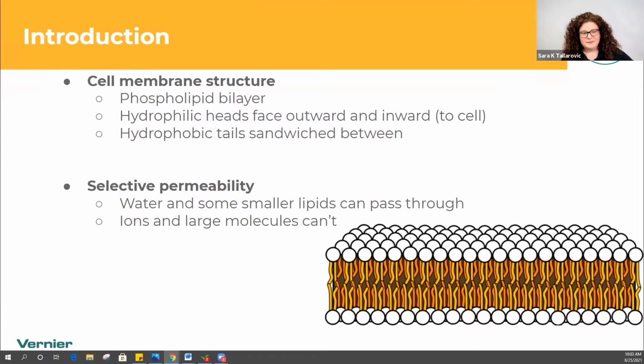And one of the challenges of teaching cell membranes is that most of the time, the options that you have might be somewhat limited. One of the most common preps that I've seen for many years now is using dialysis tubing. I think people have a relationship with dialysis tubing that's either love or hate. And so this prep is actually quite different. And I have found it to be very engaging with students. We're going to look at membrane properties using a model system with a vegetable.